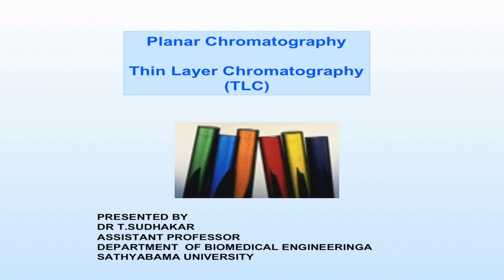Today I am going to give a lecture about analytical instrumentation regarding the chromatographic techniques. Chromatography technique is widely employed in the laboratories and research, and it has many applications in the field of biomedical and biotechnology. First of all, you must know what is chromatography.